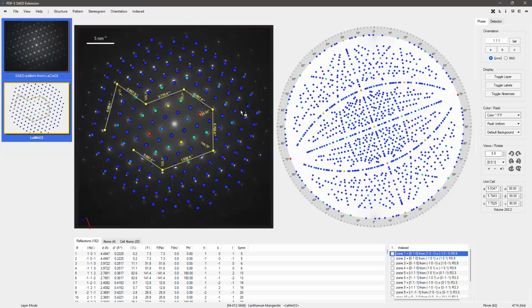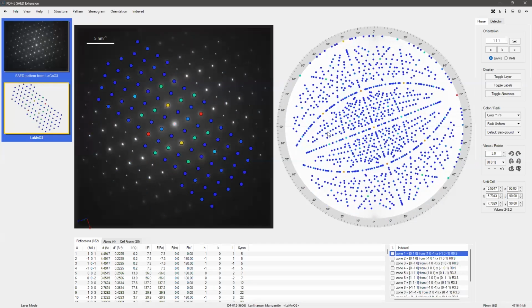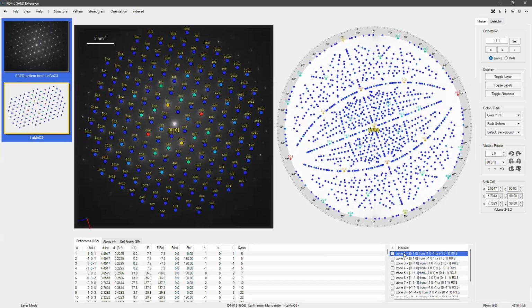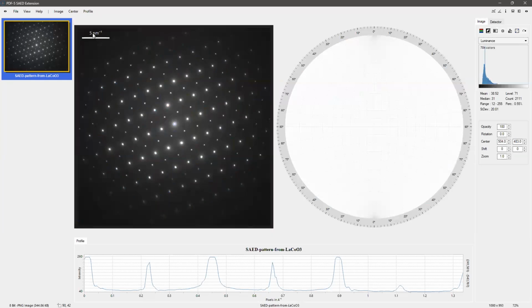Even if you zoom up and down a little, they will disappear the moment you rotate the crystal. As soon as one of these reflections disappears, either due to a rotation or other, they will be cleared and disappear. Okay, so now let's do an example for PDF search. Let me remove the crystal structure phase.